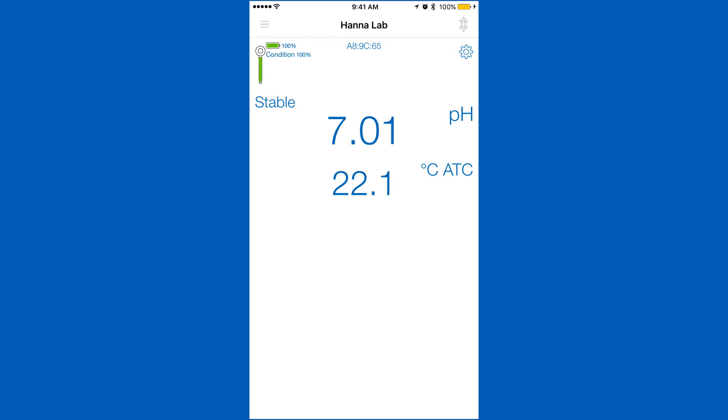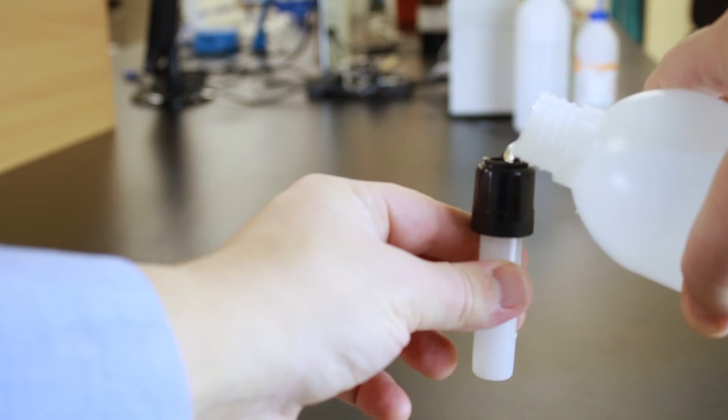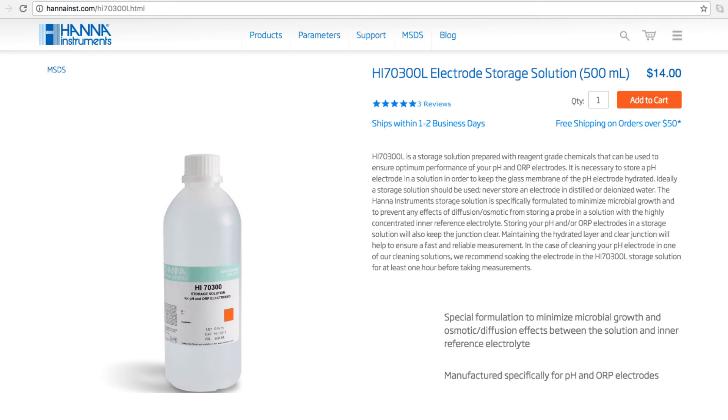Now that you've calibrated, you are ready to begin taking measurements. When you're not using your pH probe, keep it in storage solution. Without proper storage, the electrode gets dehydrated. It's best if you rinse and store your electrode after every use. We recommend our HI70300 bottle of storage solution. If you don't have storage solution, pH 4 buffer works too.